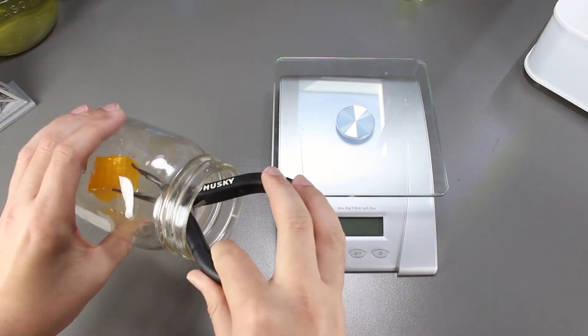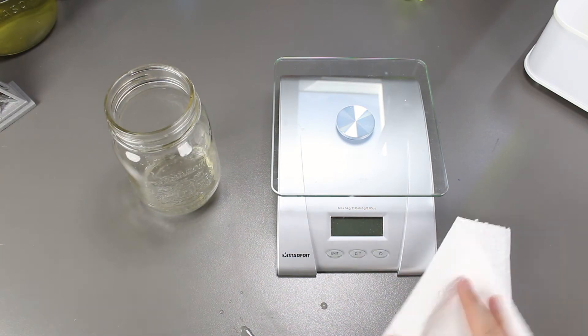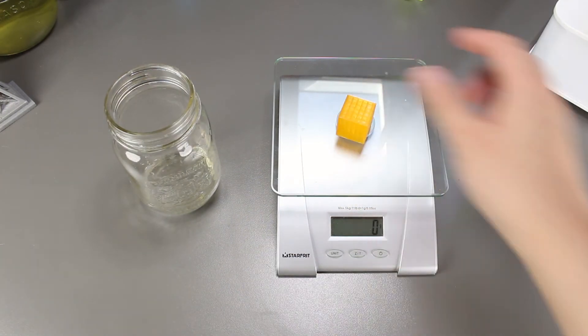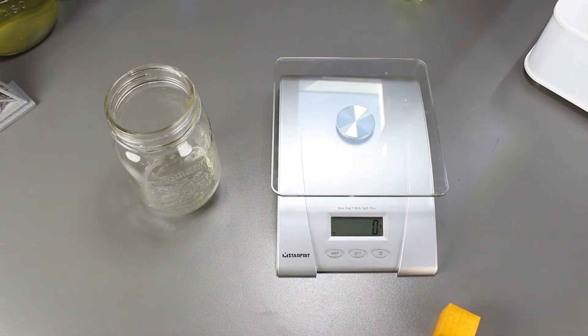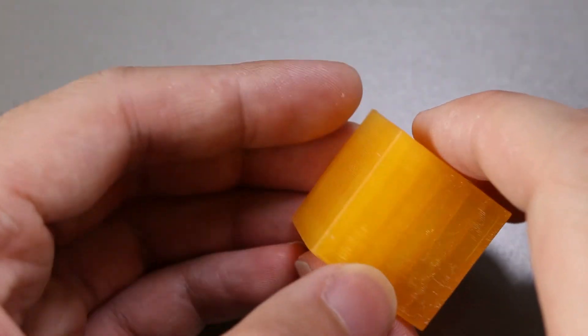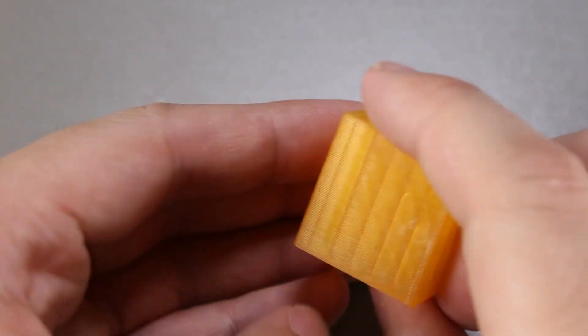Today marks the end of this experiment. Let's find out one more time whether or not the cube lost any mass from being broken down by the bacteria. Very interesting — the mass of the cube actually went down by a gram. Looks like the bacteria did do its job after all. Now let's take a look at the cube to see if there's any visible difference. The cube looks completely new, same condition as when I put it in 4 weeks ago.